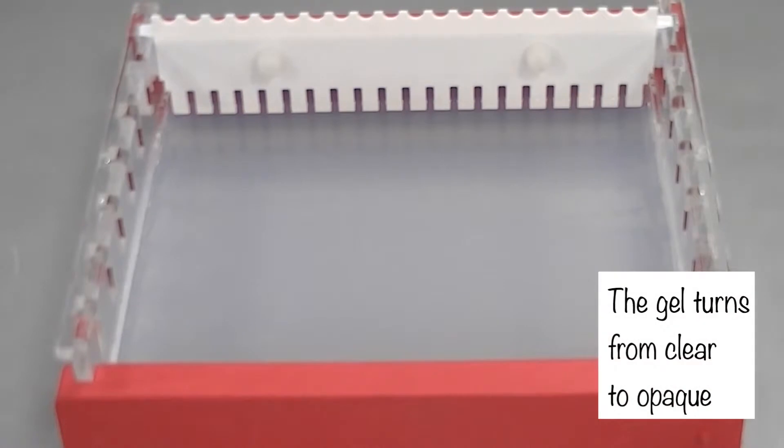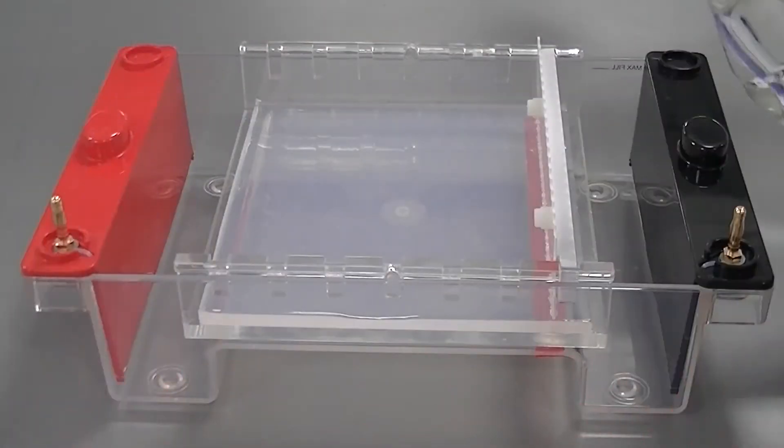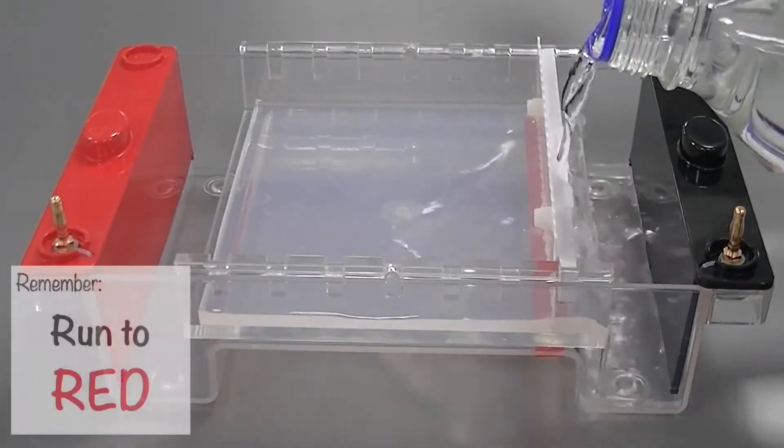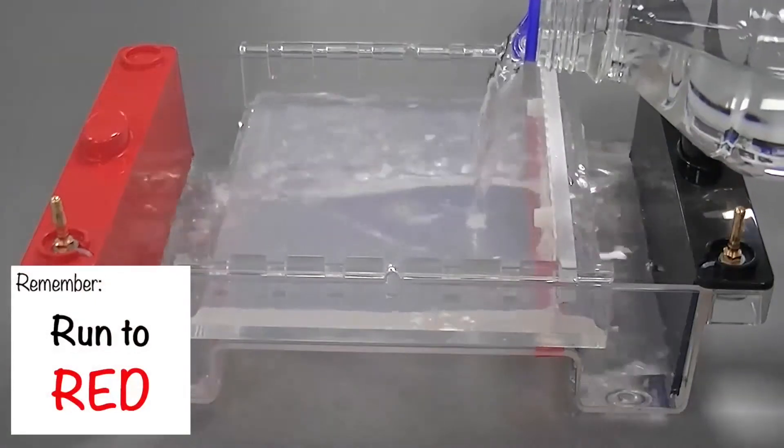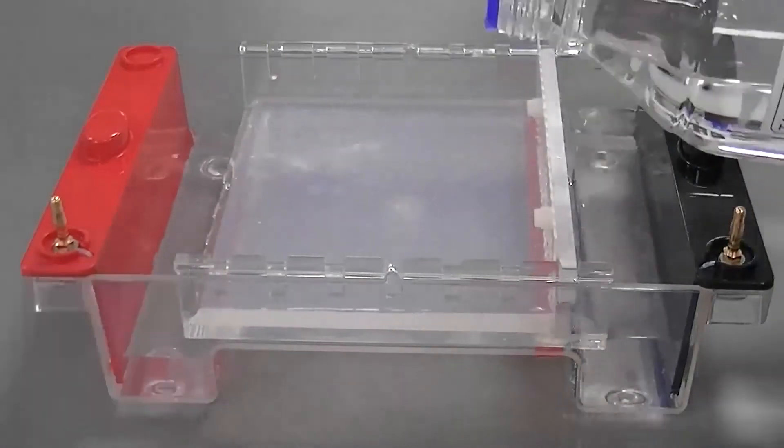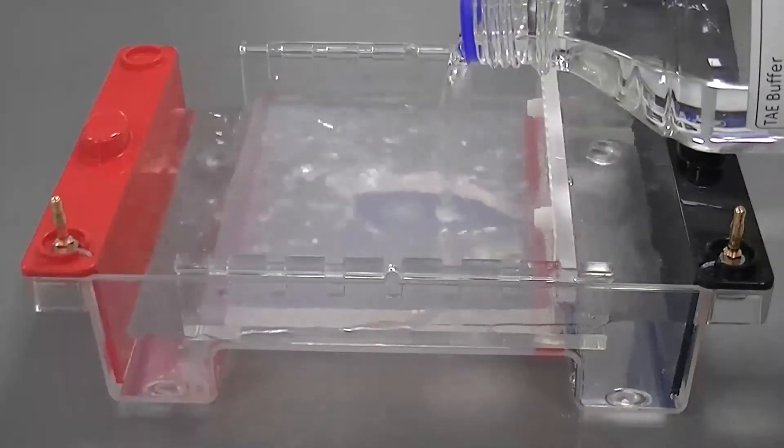Place the tray into the tank with the comb at the black end. DNA will migrate to the positive anode because of the negative charge on the phosphates of the DNA. Fill the tank with TAE buffer until it covers the gel by 1cm.